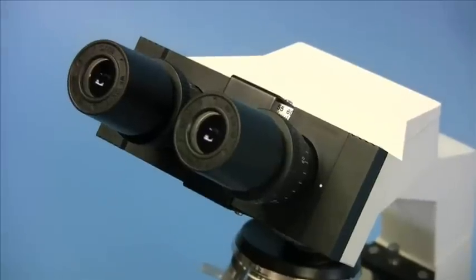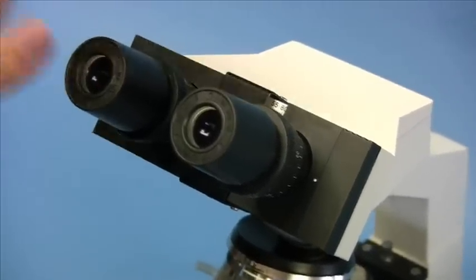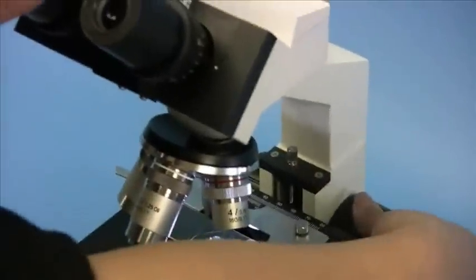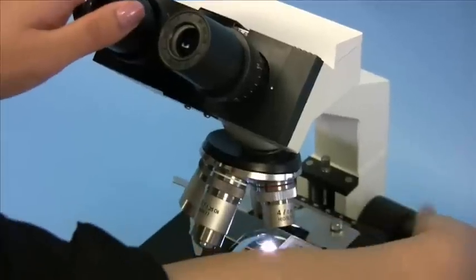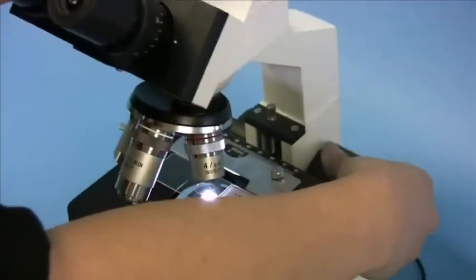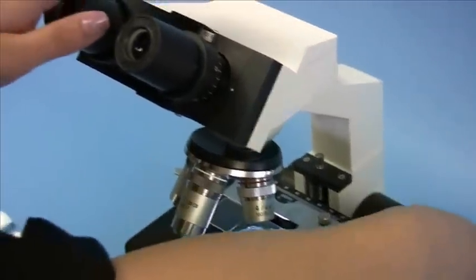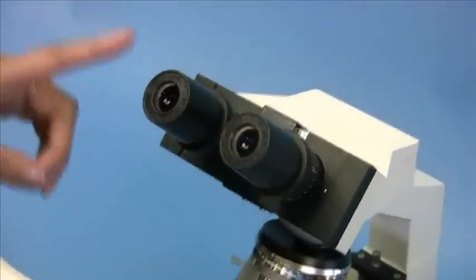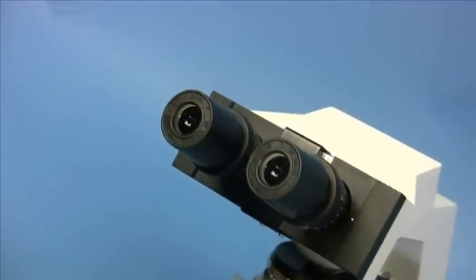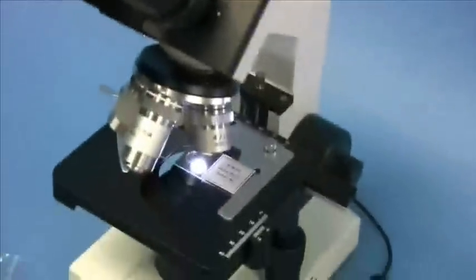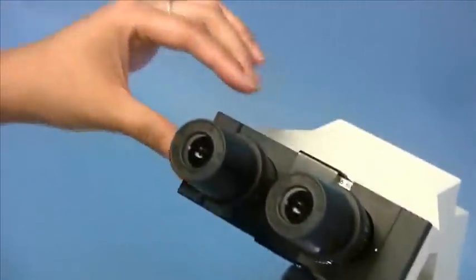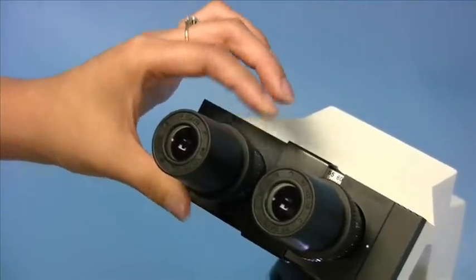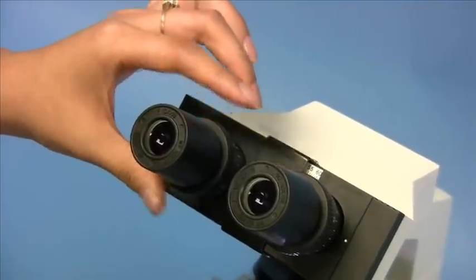Now close one of your eye, let's say the left one, and use your right eye only. Get the image to be focused using the coarse and fine focus adjustment knobs. Once you get it, close your right eye and use your left eye only. Now this time, do not touch the focus adjustment knobs, but only the diopter ring. Adjust it until you get the image focused.